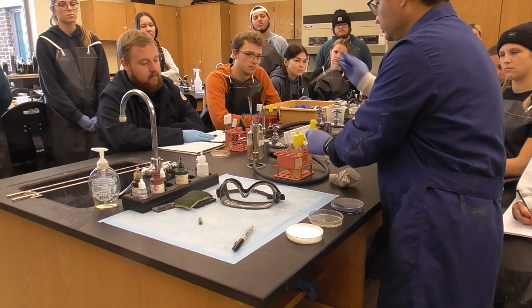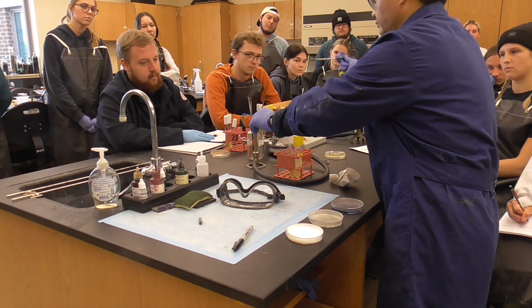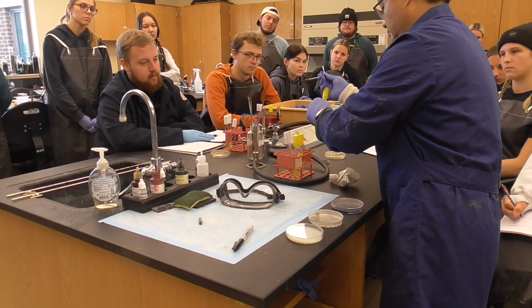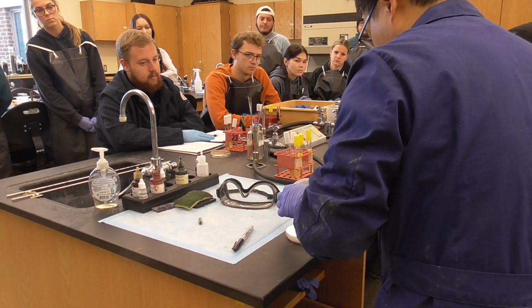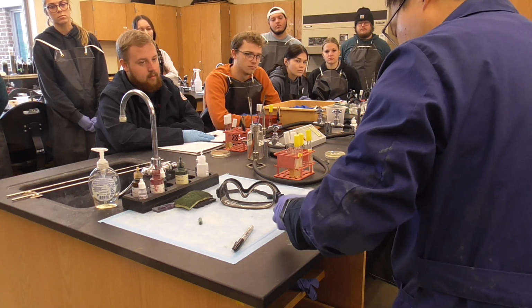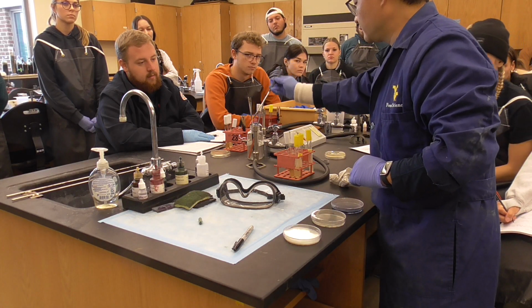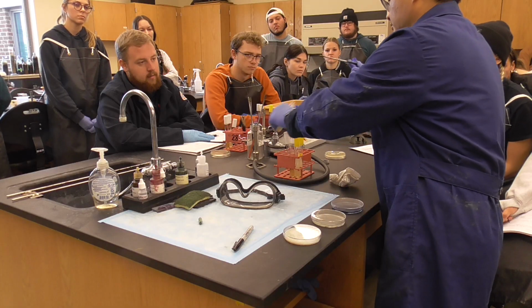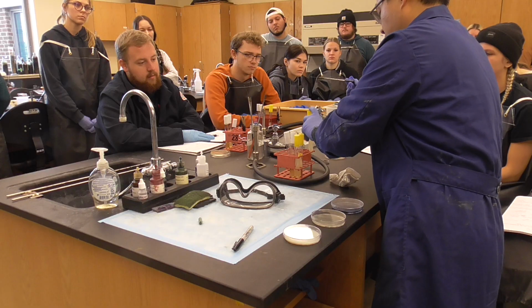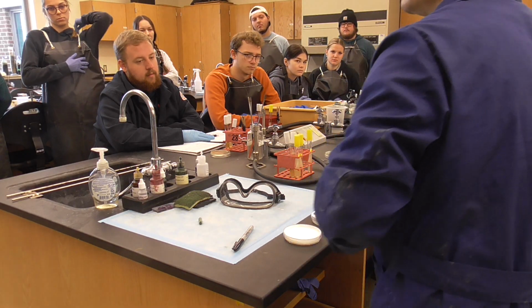If you want to save time, flame the loop, pull it down, and go like that. That saves you a bunch of time. You have to be careful, because you want to see the back. Every single one you still have to change. So flame the loop. Touch the bacteria, the last one, right here.